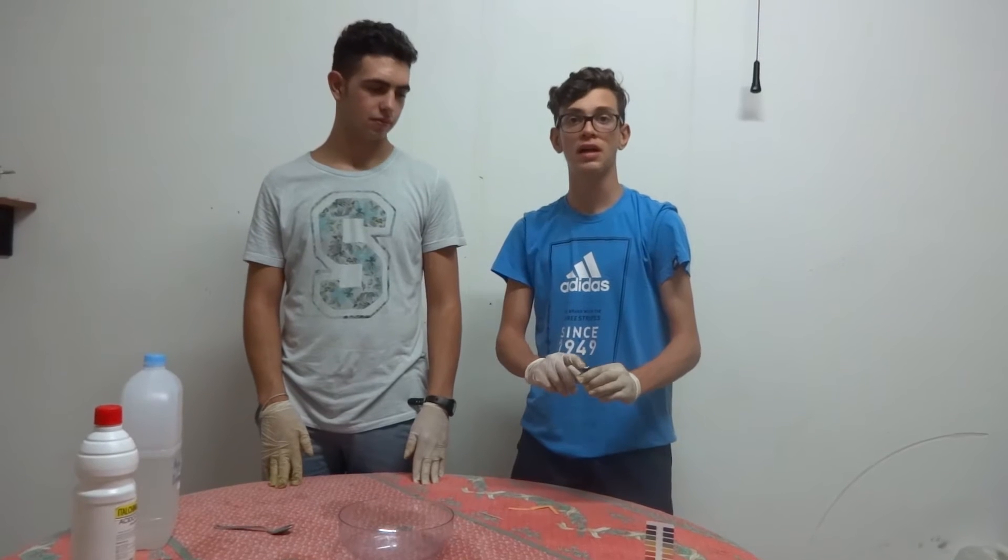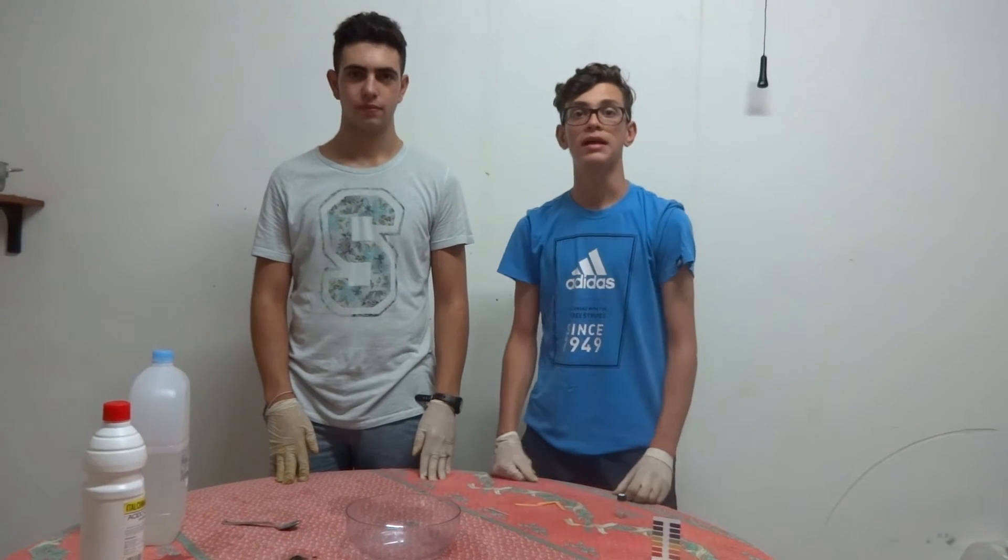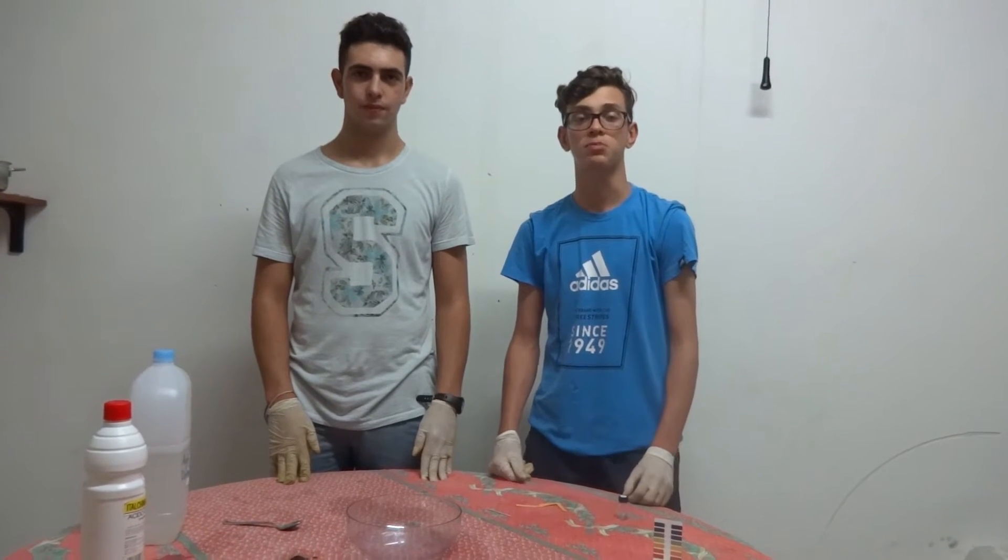Hi guys, today we are going to do another experiment, very interesting, between the sodium metallic and the distilled water. And at the end we can see a big explosion.